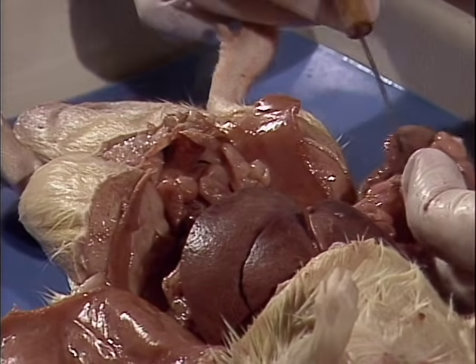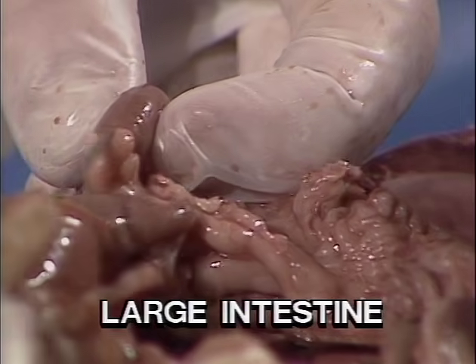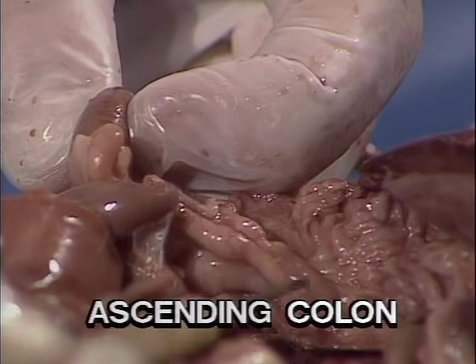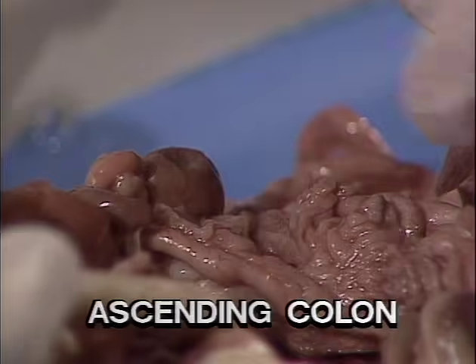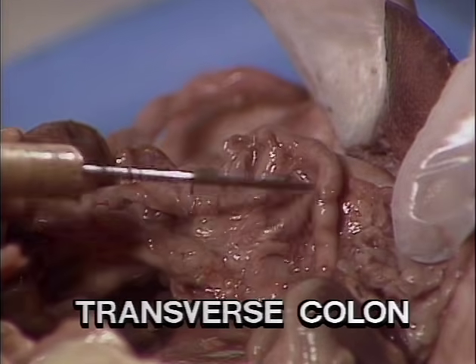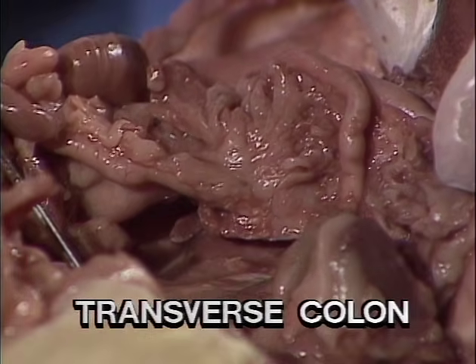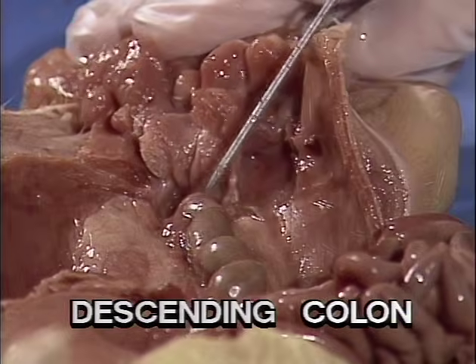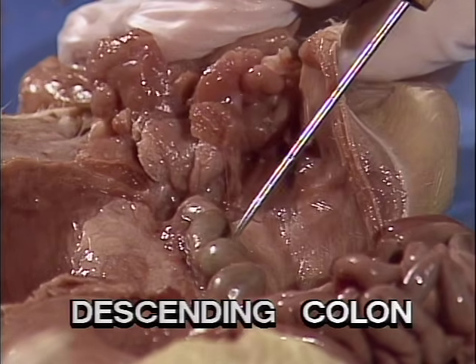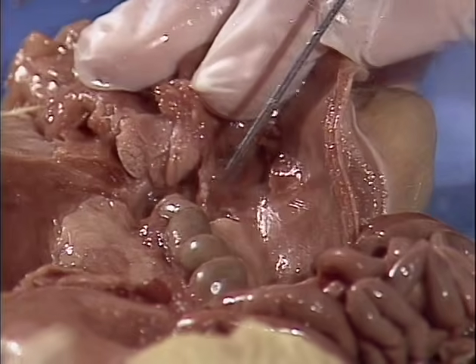The structure leading from the cecum is known as the large intestine or colon. As it moves towards the cranium, it is known as the ascending colon. As it goes across, it is known as the transverse colon. As it moves towards the tail, it is called the descending colon. These small masses we see in the descending colon are fecal material.